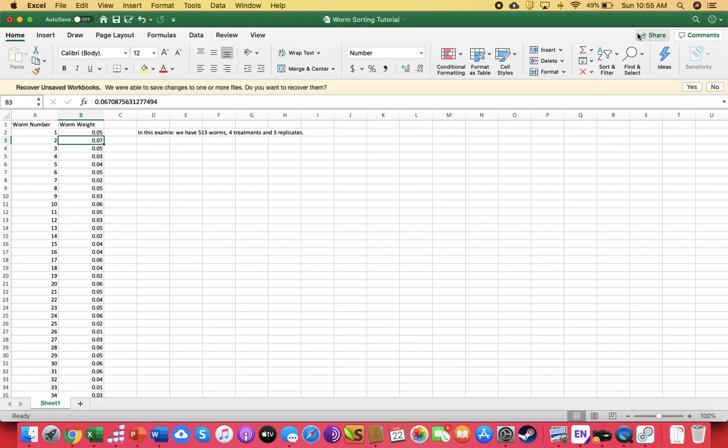So I'm going to show you a slick little trick that you guys should all be doing every time you're weighing worms and putting them into tanks, where you're using Excel, which we're in right now. And we're using something called Stat Plus, which I told you to download. It's free. If you get really slick with it, you can use it more, and it's less than $100. And okay, this is what we're going to do.